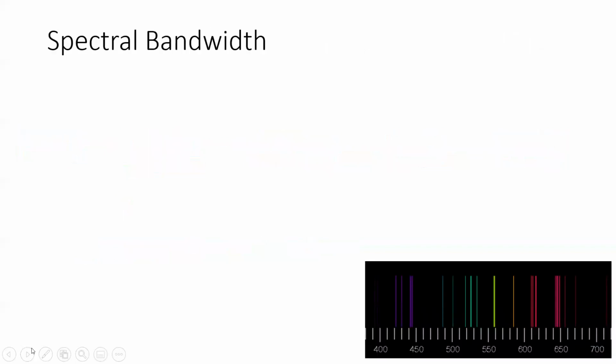So if you've ever done an atomic absorption or atomic emission lab in Gen Chem, maybe you looked through those black spectroscopes at some elemental light source and you saw the individual lines, right? I know that if you were in my Gen Chem, you did. Here, this little image at the bottom is the calcium emission spectrum.